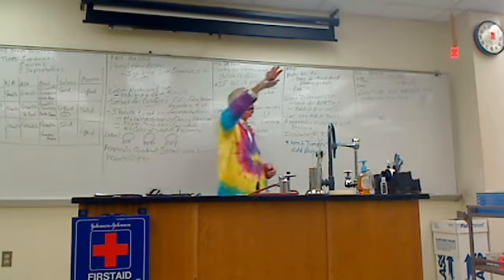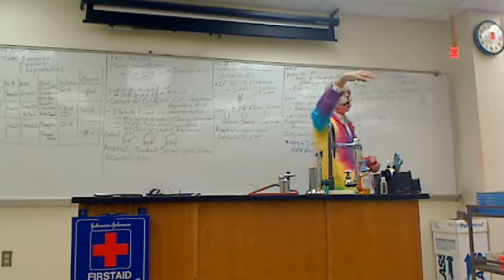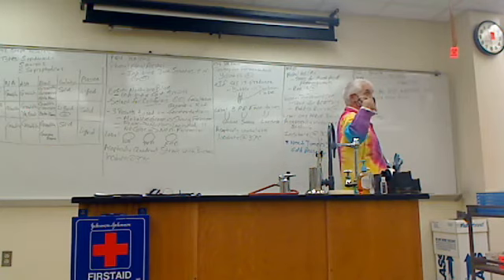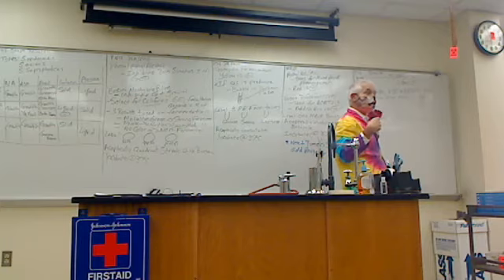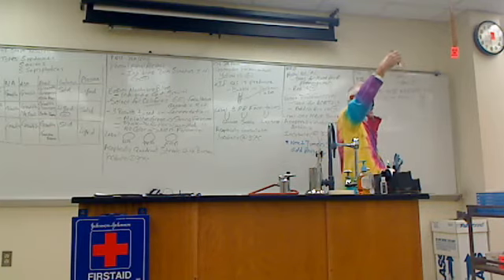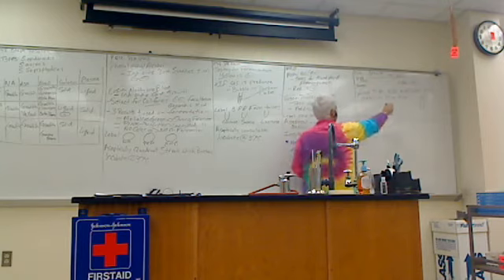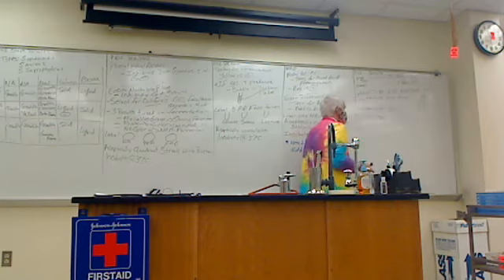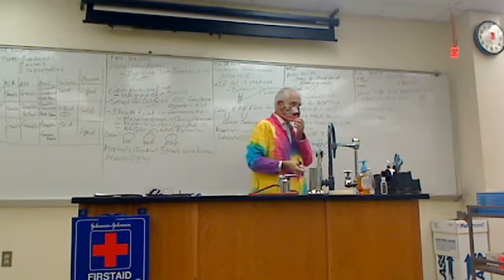If any of you over here feel left out and want to stab one, you are more than welcome to stab or inoculate any of these other ones. But if you want to stab one, seriously, just for the experience, go ahead and grab one. Sound good? Okay? And then again, we're going to incubate at 37 degrees C.